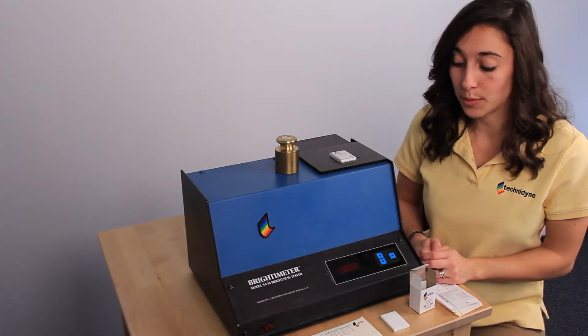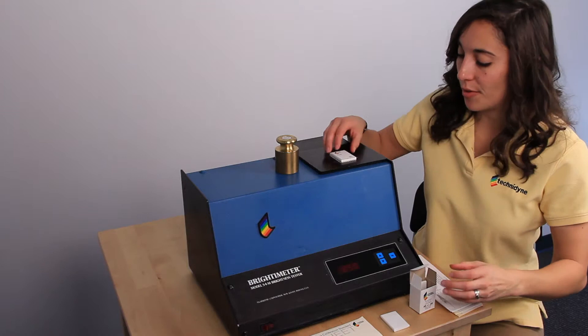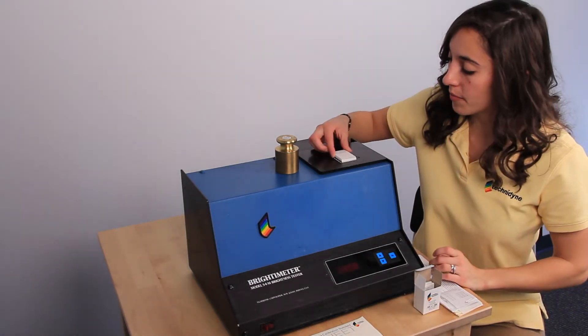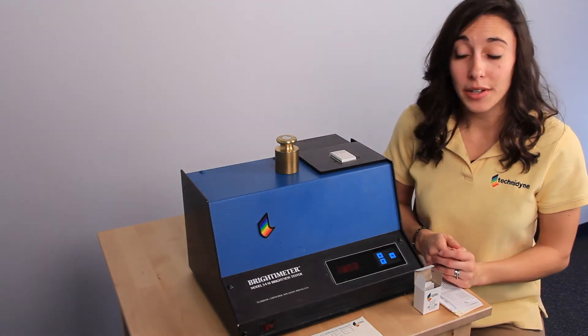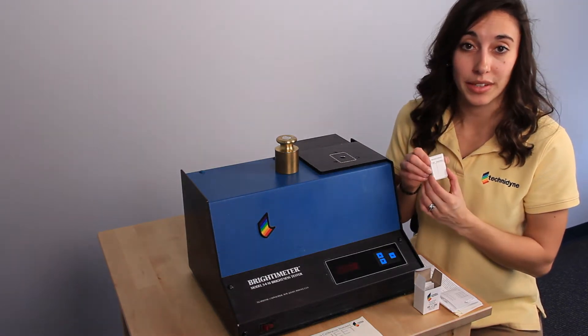My display is reading 86.0 and my standard is 86.1, so I can go on and move to the next step. I'm going to load my working standard, and you can write the value on the display underneath brightness next to today's date, and your calibration is complete.